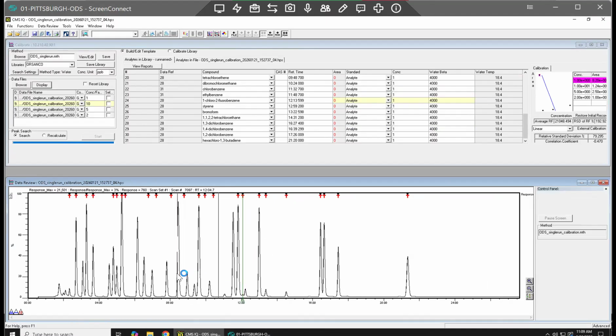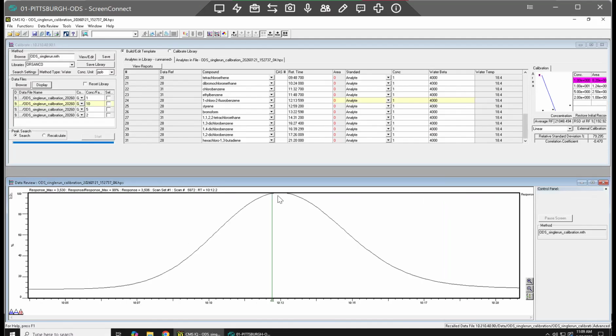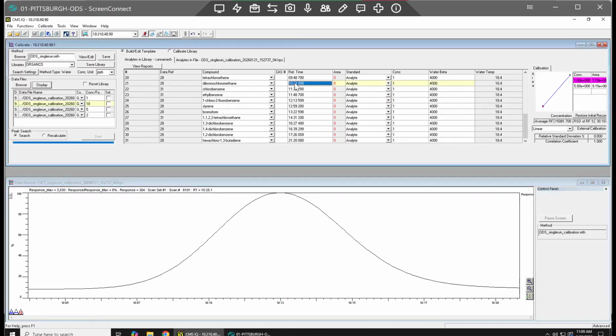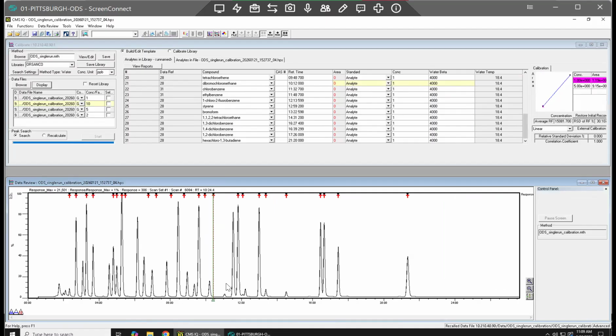We'll just do a couple more. Yeah, now these are just kind of off by a little bit. So this one, double click. Before chlorobenzene is dibromochloromethane, 1024. So that's probably this one, 1012. We'll change that one. I don't know if you can scroll over. I don't think so. So that was this one.